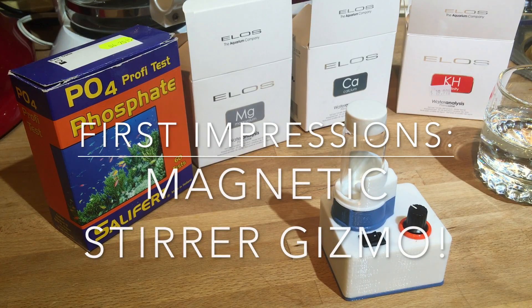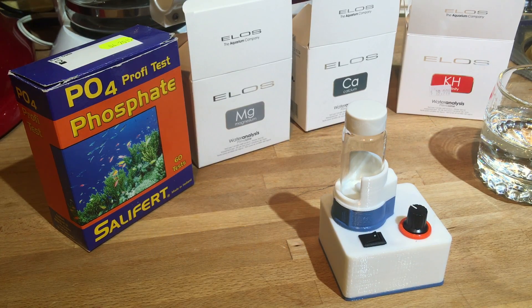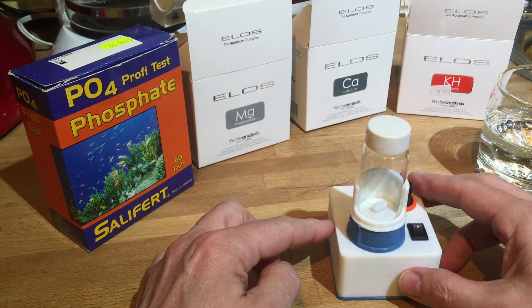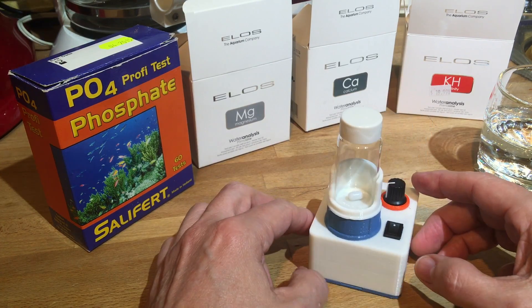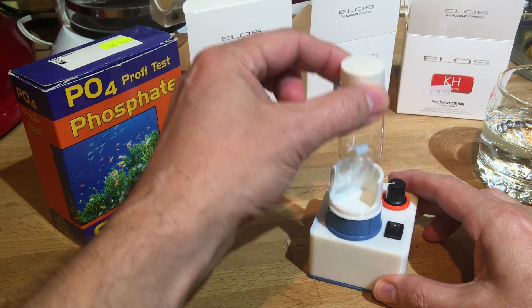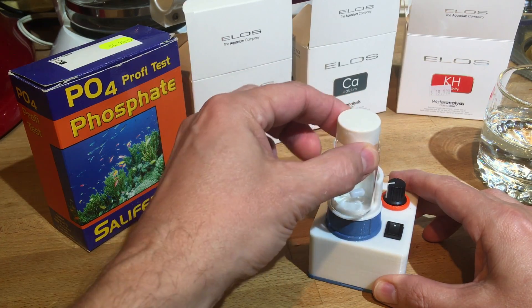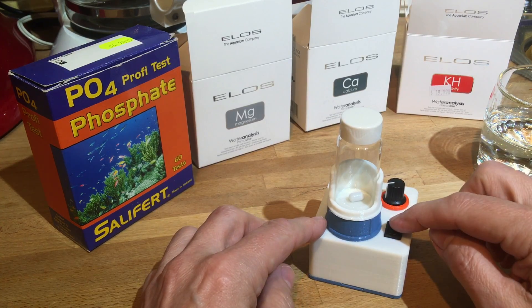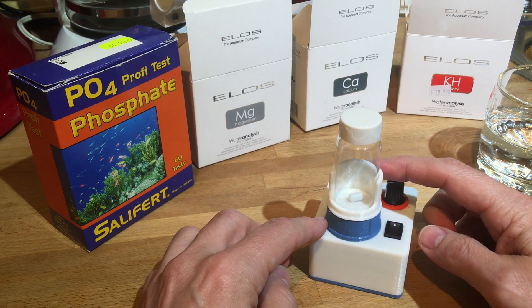I wanted to share something I received as a gift from a man overseas. I saw pictures of this online, got super excited, wrote him, and he was nice enough to send me a couple of them to try out. What you're looking at is a device he printed himself on a 3D printer — it's a magnetic stirrer for doing water testing that will make a little magnetic bead inside spin. There's an on/off switch and an LED light.